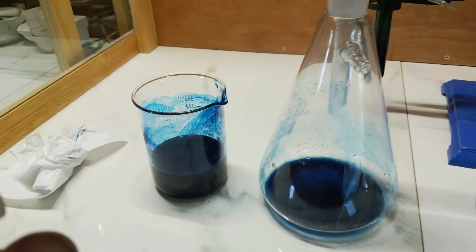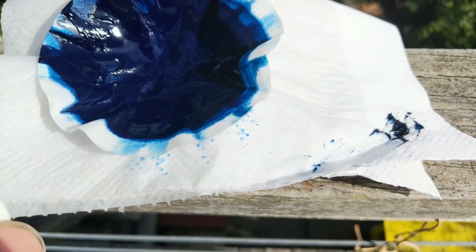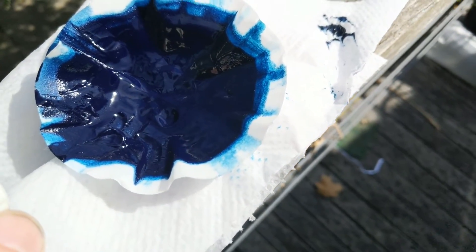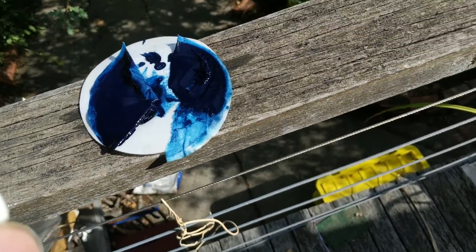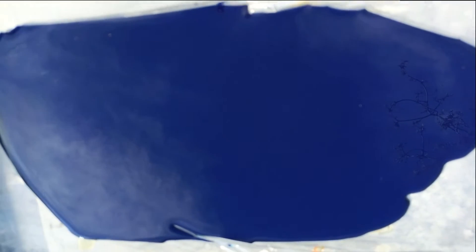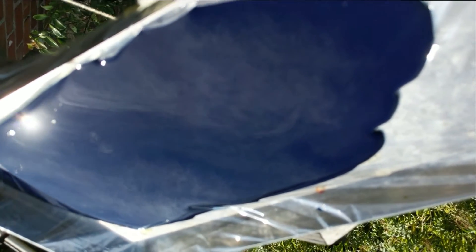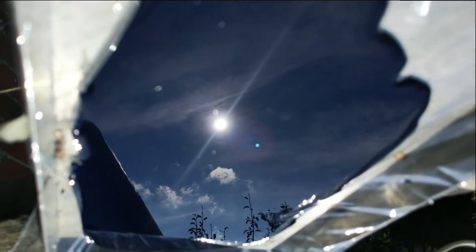Heading outside to show the pigment drying in the sun, just trying to get as much moisture out as possible. Some of the pigment was poured out onto a large plastic dish to evaporate the water more quickly, which ended up creating a really interesting blue mirror effect that looked quite cool.